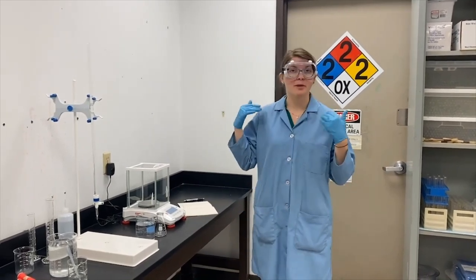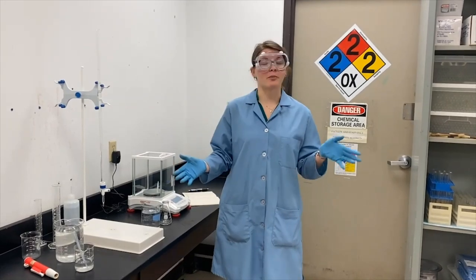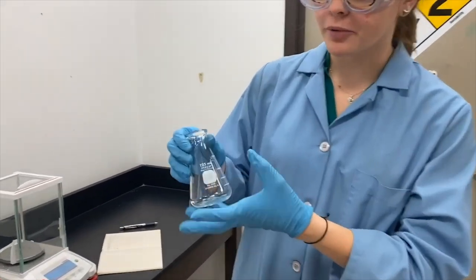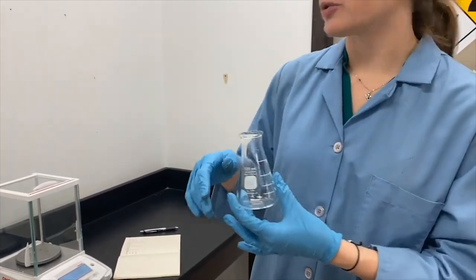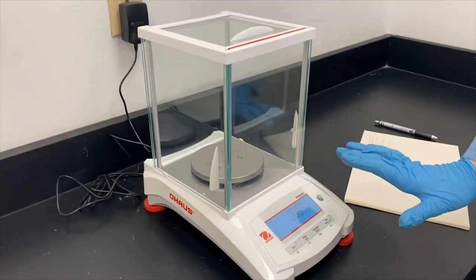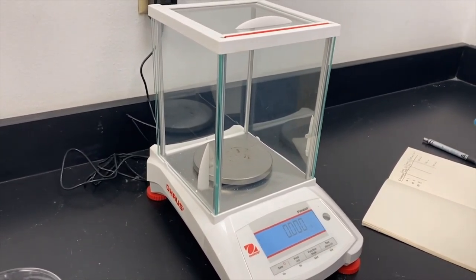I've got my PPE on and we are ready to start the experiment. Even though we're just using water, we still need proper PPE on because there might be other chemicals in the lab that we could get harmed by. I'm going to start with our Erlenmeyer flask — a 125 milliliter Erlenmeyer flask — and I'm going to put 100 milliliters into it. Before I do that, I need to take the mass of it while it's dry to determine the mass of just the water by itself. This is an analytical balance — it measures mass in grams, which is not the same as a scale, which measures weight. Mass and weight are not interchangeable.